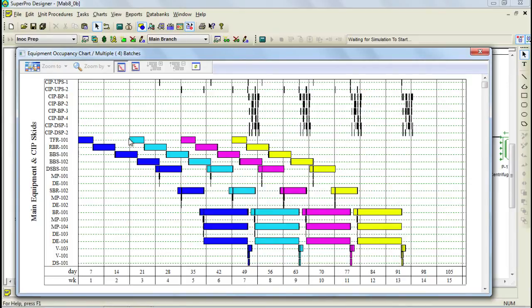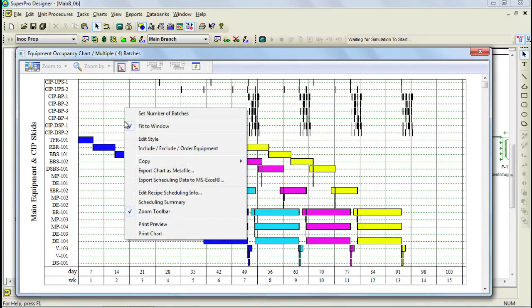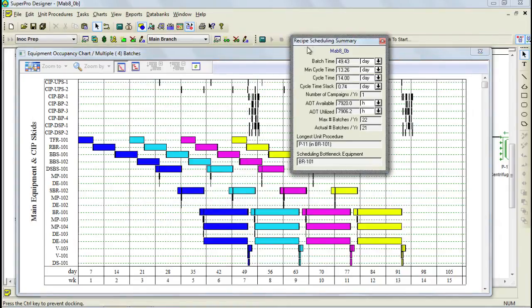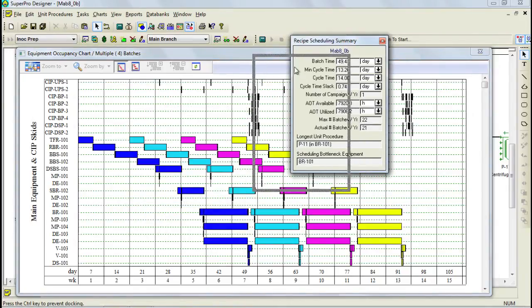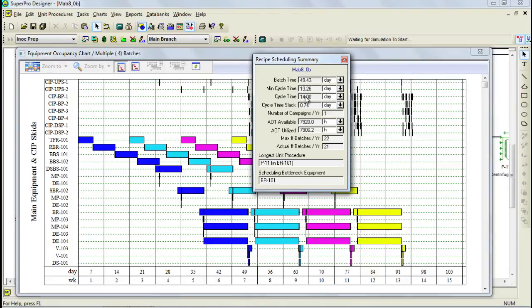For this example, the process cycle time is two weeks. That can be seen by right-clicking on the chart and selecting Scheduling Summary. Through this dialog, we can see that the cycle time is two weeks. Furthermore, the amount of batches that can be carried out with this cycle time and a specified annual operating time is displayed in this area. This dialog also displays the bottleneck equipment, which would be Bioreactor 101 in this case.